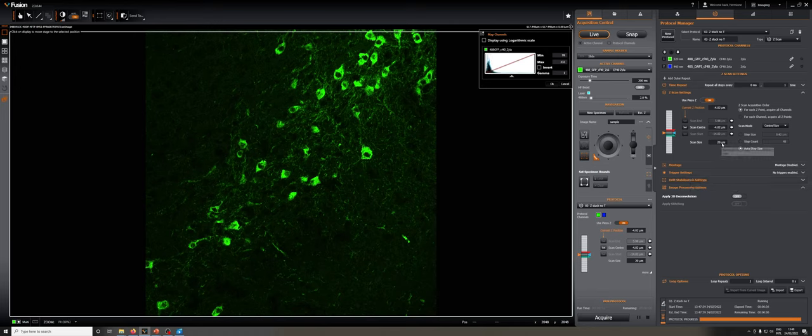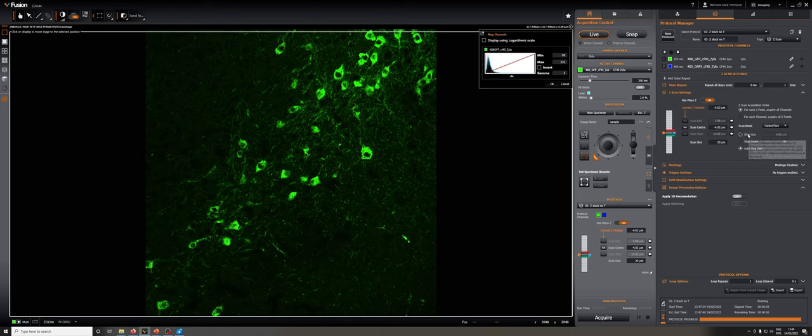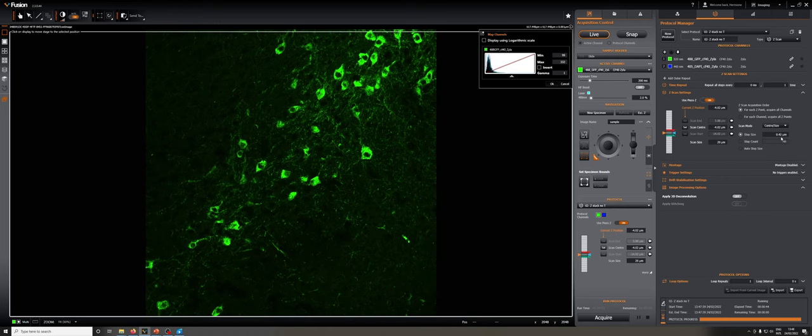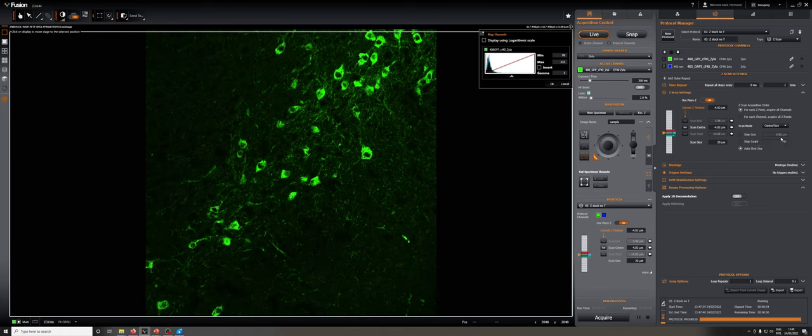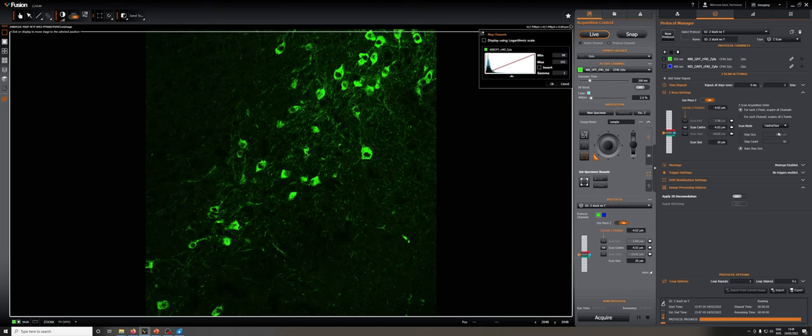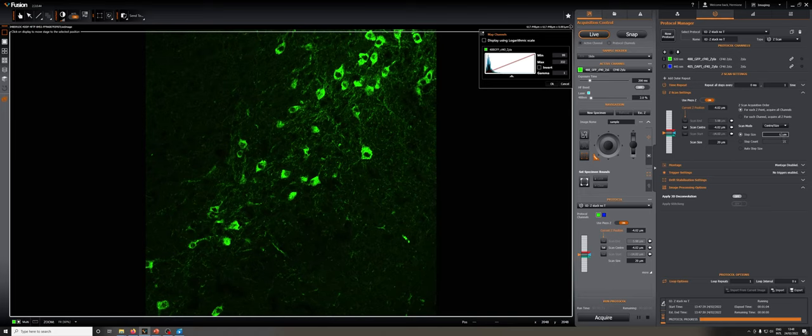We determine what scan size we want, and then we determine what step size we want. For step size, we can either input a value, for example, we may want a value of one micron. We can either input a number, which is less useful, or say auto step size, which roughly sets the step size to acquire something at maximal Z resolution, which can come at the cost of significant bleaching in time. I'm just going to take one micron for this demonstration.